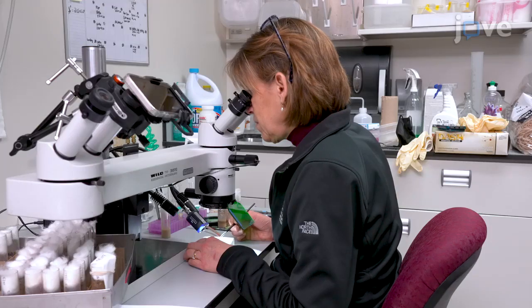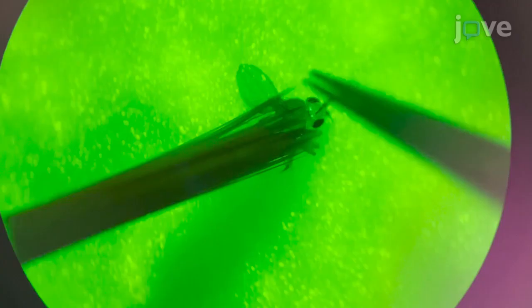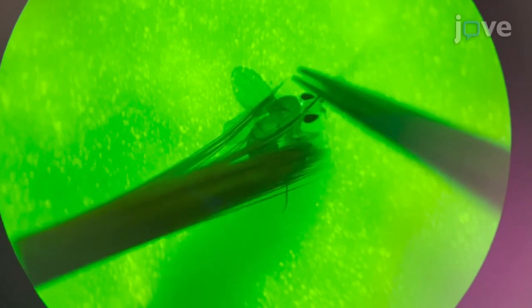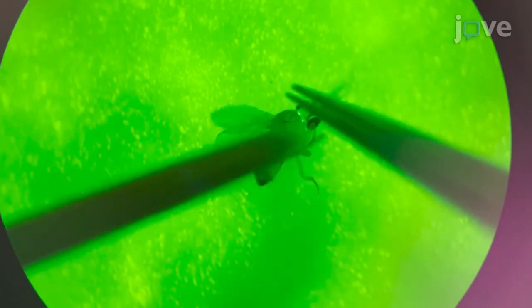We anticipate that using this technique to understand the molecular mechanisms underlying adult neurogenesis will be relevant to human neural regeneration. Learning this technique requires patience and perseverance. We recommend practicing on 5-10 brains daily for several weeks before collecting brains for analysis.